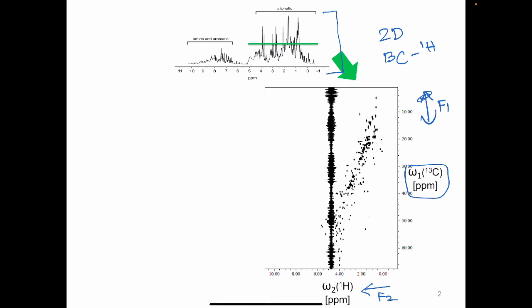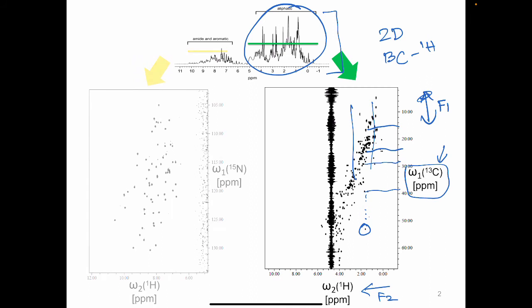You are able to see that the chemical shift of carbon is encoded in addition to the chemical shift of proton. For instance, I've just circled the proton here, and if you see, there are many protons that end up having their overlap resolved by the carbon resonances. I don't have to exemplify any further. This helps you understand how an additional data set would help you assign something for a biomolecule.